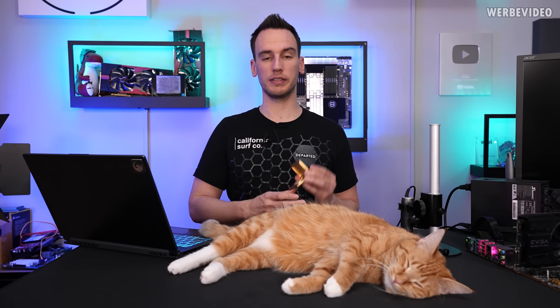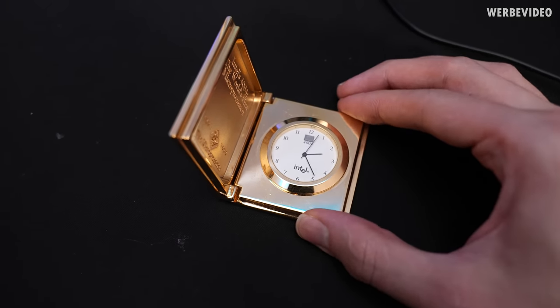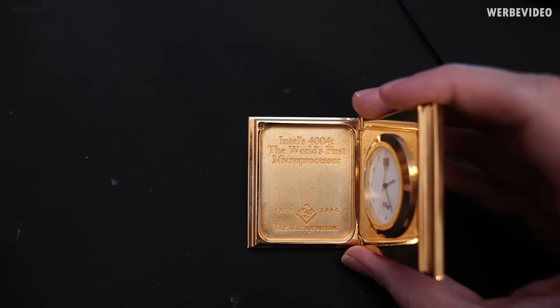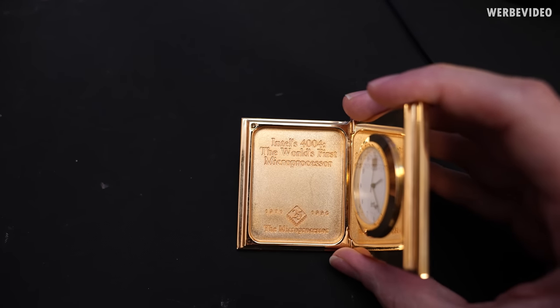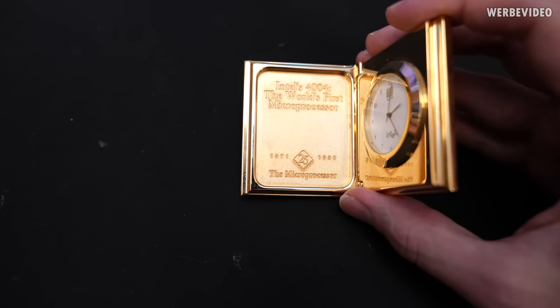Before we send this to TESCAN and disassemble it, let's put it under a microscope. I decided to first remove the glass, which should make it much easier for the microscope to zoom in further. It says Intel 4004, world's first microprocessor, 25 years anniversary.